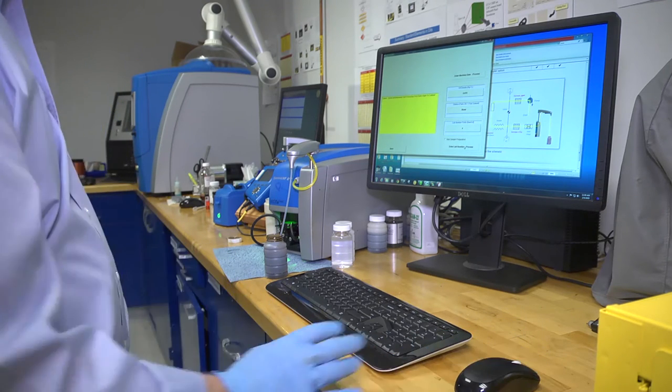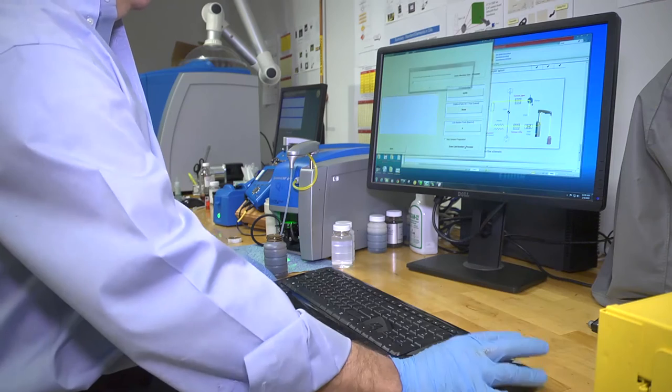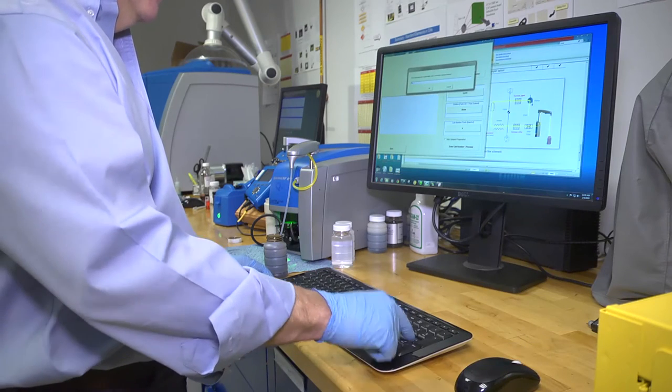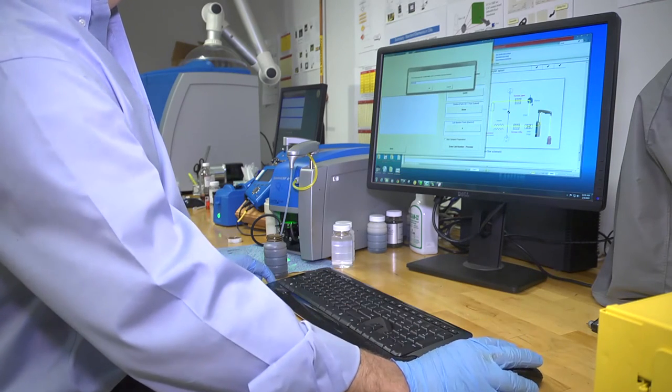So I'll enter a simple lab number. I'll call it sample 123658.